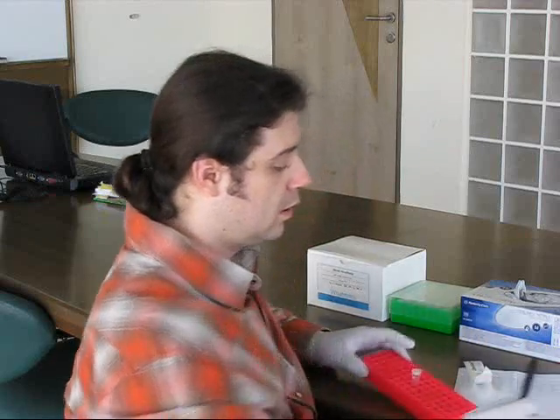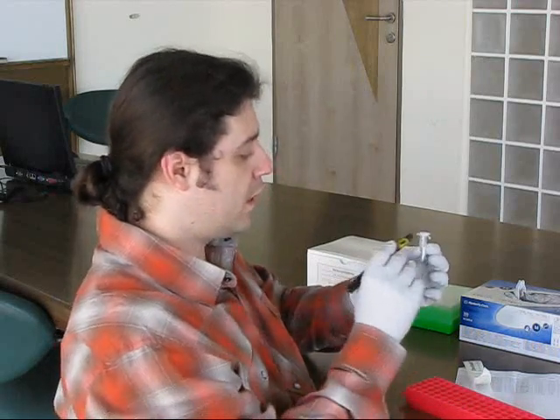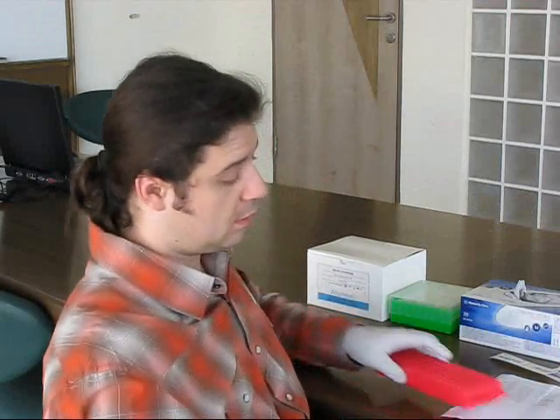After that, I write the number of the sample on the lid of the tube, on the side of the tube, and in the list of samples. Please take DNA twice from every man. Thank you.